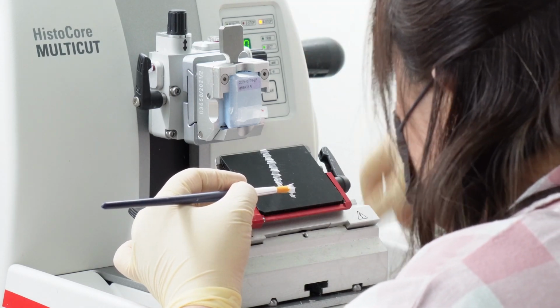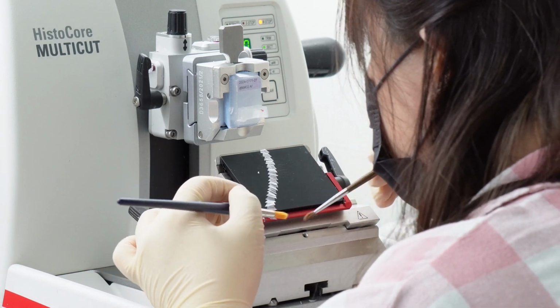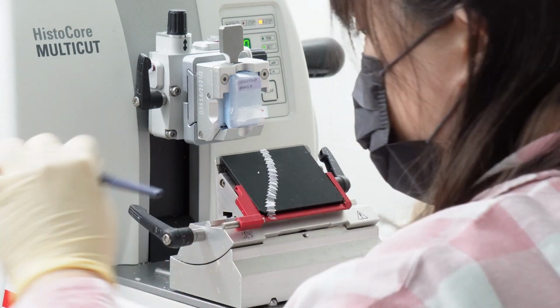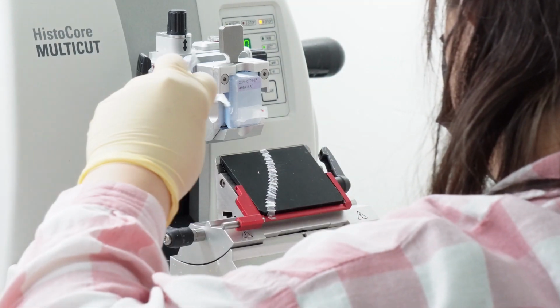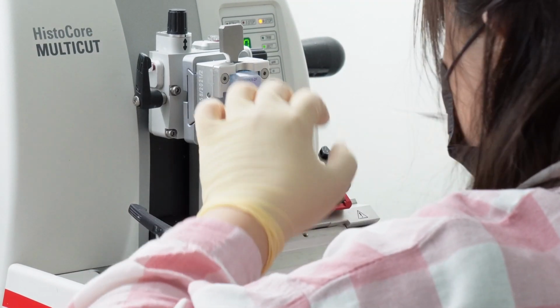The guide recommends a quiet environment. When you're trying to cut slices that are mere micrometers thick, you need focus. Even small vibrations or distractions can mess up the cut, ruin your sections. Stability is important. And the goal isn't just single slices, but ribbons.